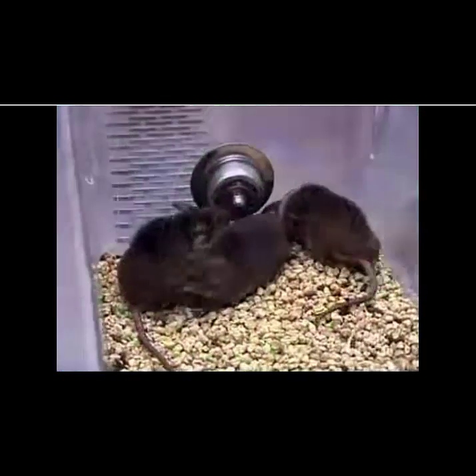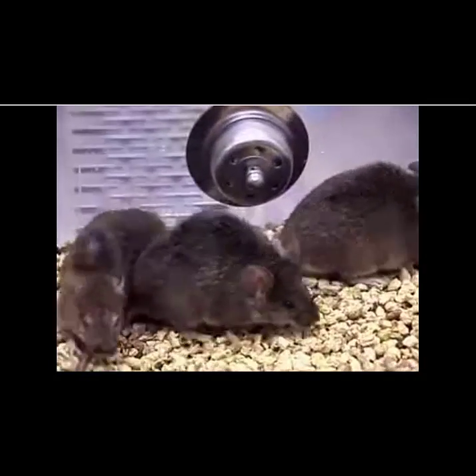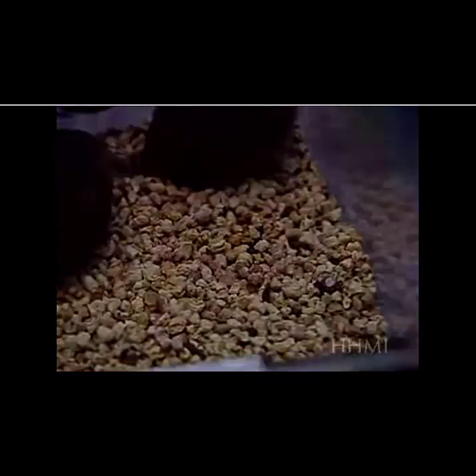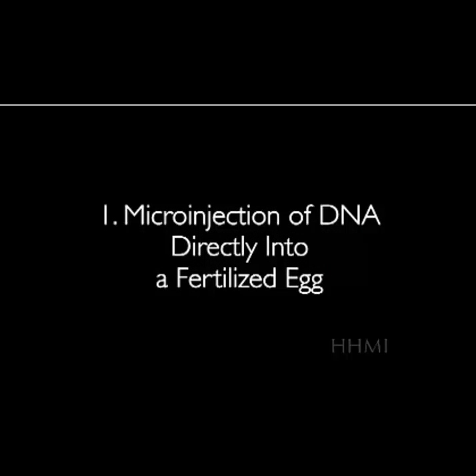inside the cells. A mouse in which a foreign DNA, also known as a transgene, has been incorporated into its genome is called a transgenic mouse. There are two main ways to create a transgenic mouse.